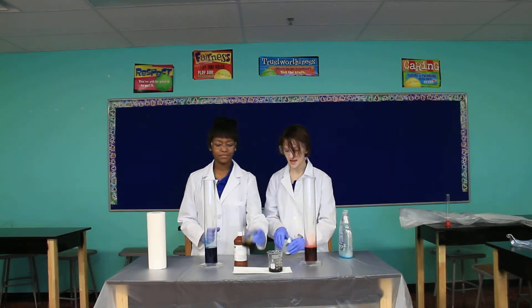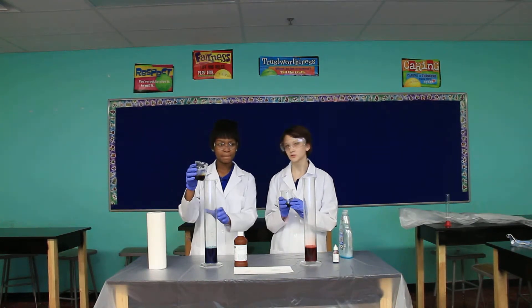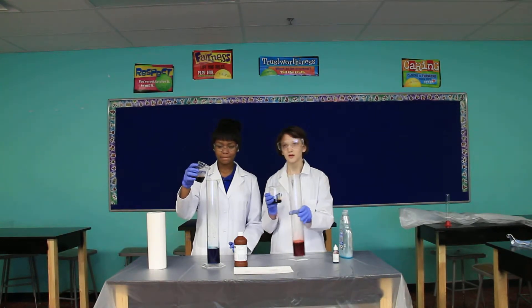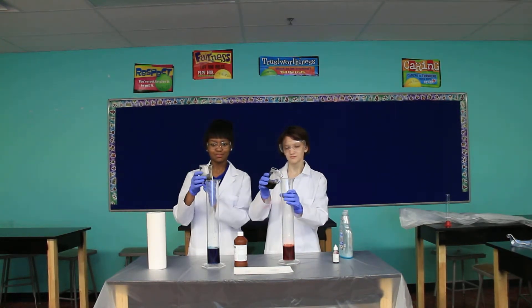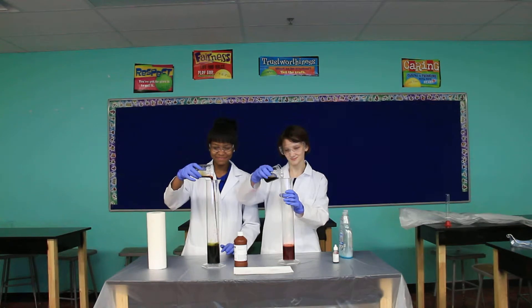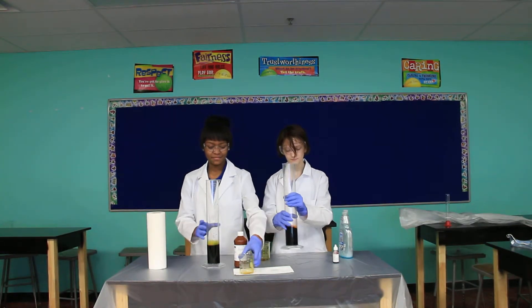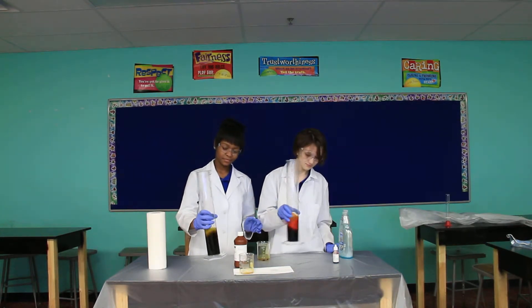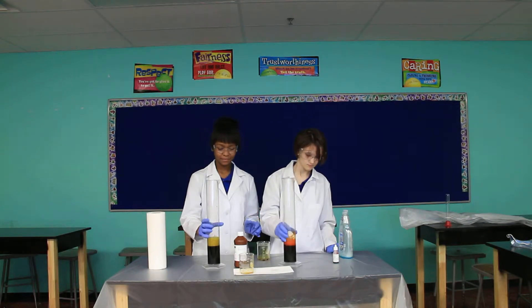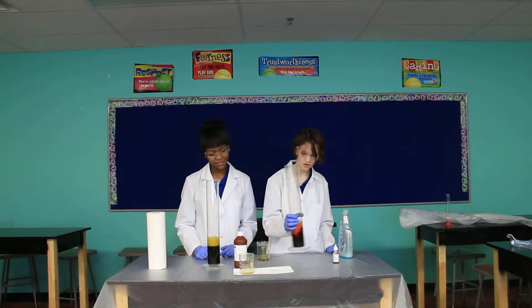And now we get ready to add our catalyst. This speeds up the process, and for our catalyst we're using potassium iodide. And then we stir that — mix it together.